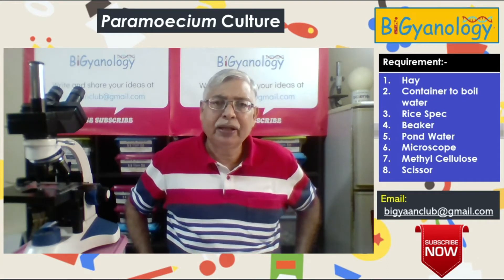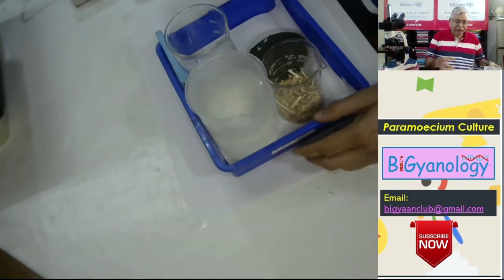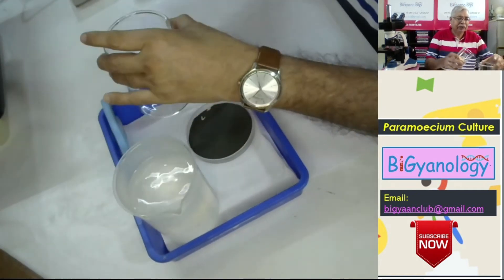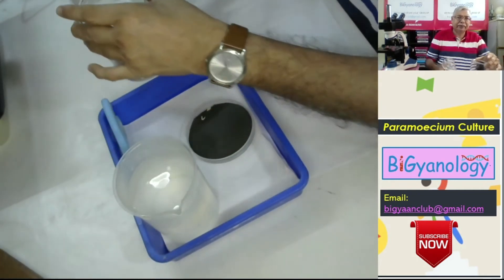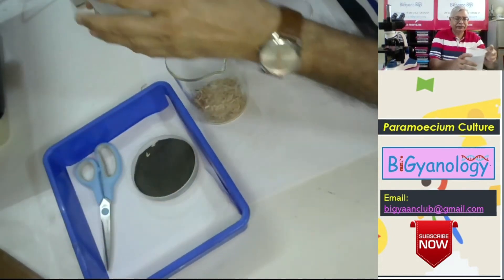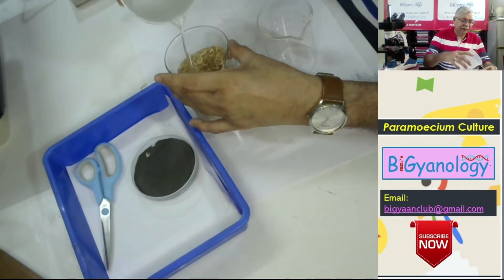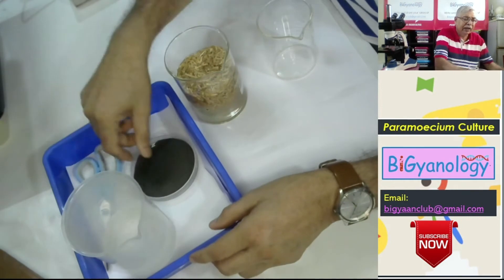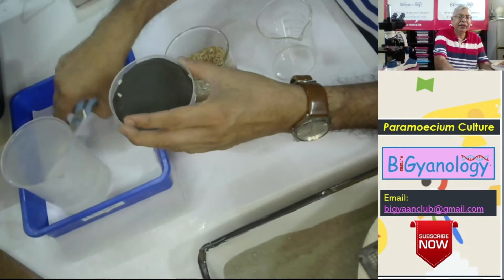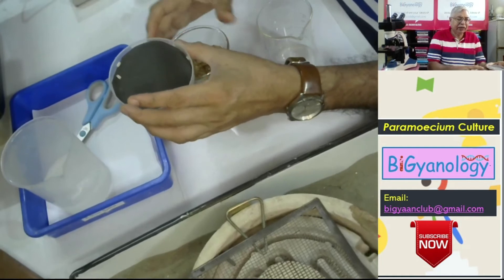So here we are, let's start. We need some items: a handful of hay put into a 500 ml beaker. I have given some water here, about 500 ml of water. And we need a small speck of rice. We need scissors if the hay is not already cut.